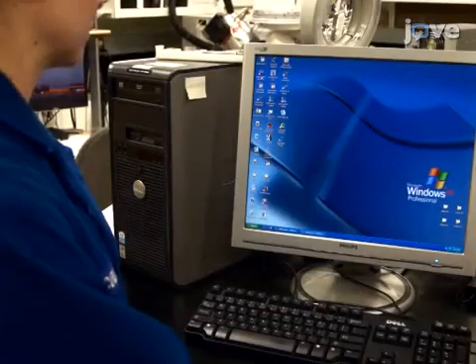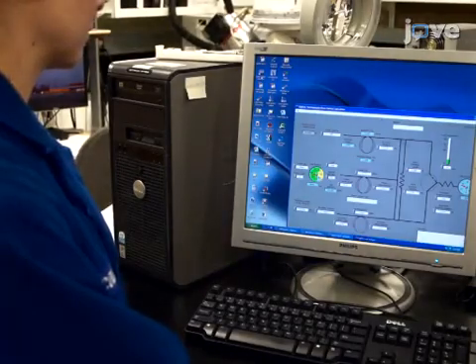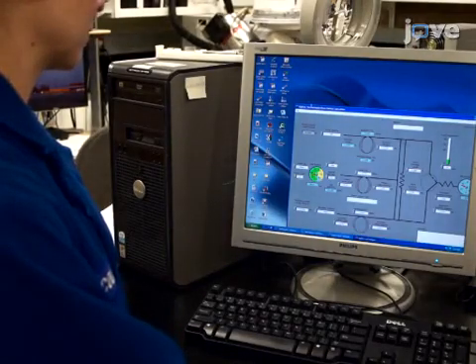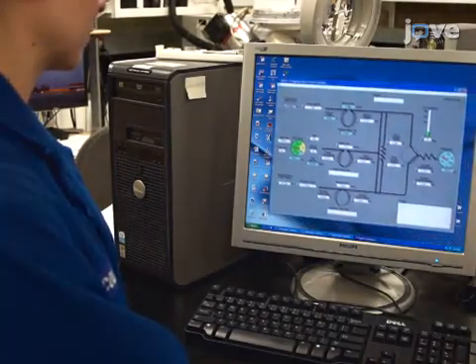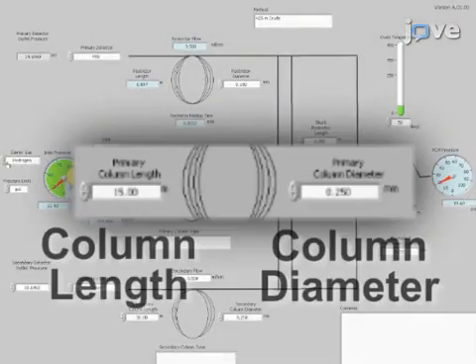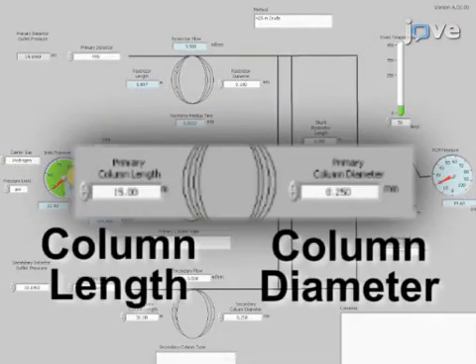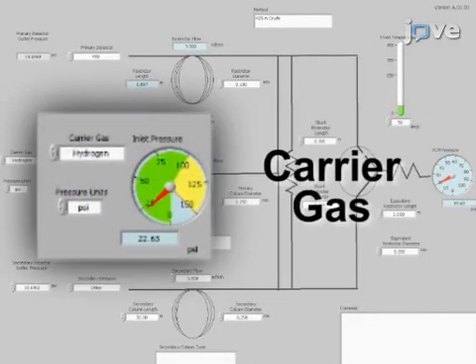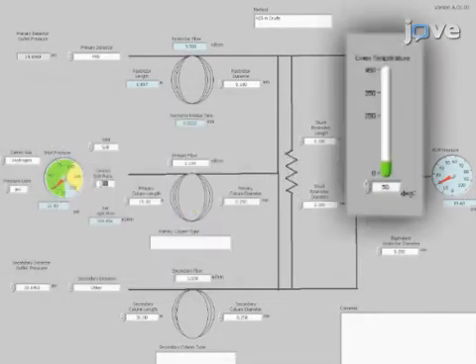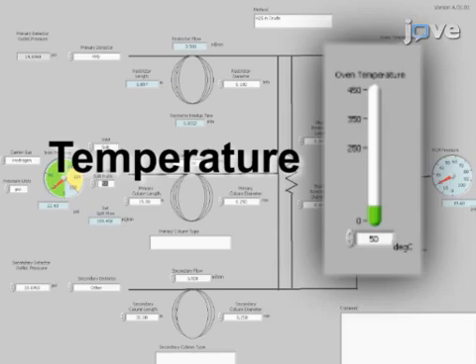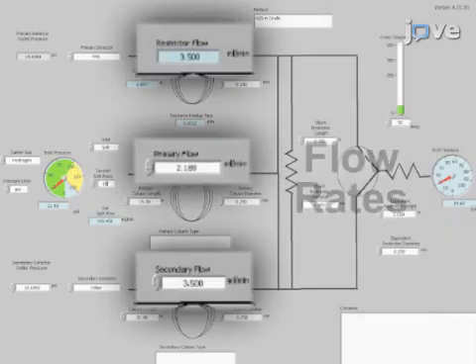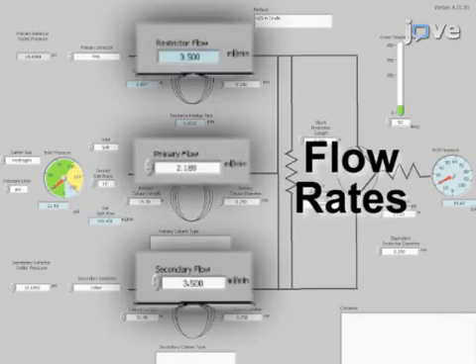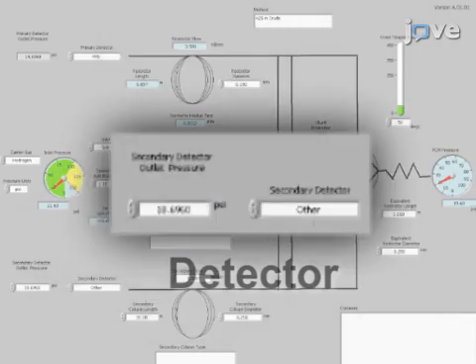To begin, open a Dean Switch calculator program on a computer and input the column dimensions, carrier gas, temperature, desired flow rates, and detectors used.